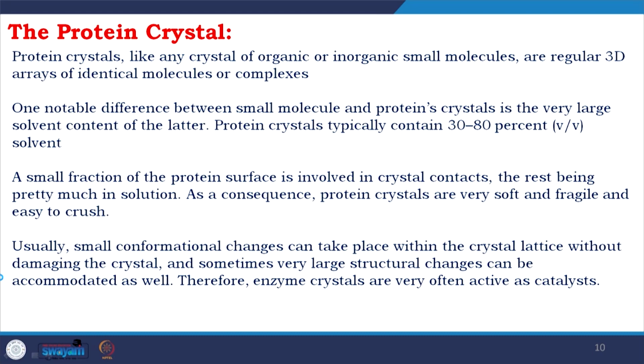Many people, this is very important, many people think when the protein goes inside the crystal, it is in a frozen condition, because the outcome of the protein crystal is a static structure. But when people have done experiments, for example, I personally have a good experience where we are working with an enzyme, beta lactamase, and beta lactamase is an enzyme which has something very interesting.